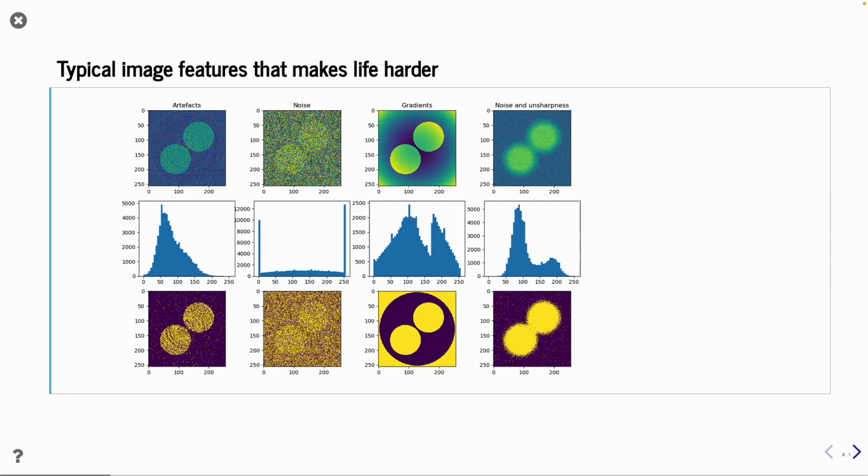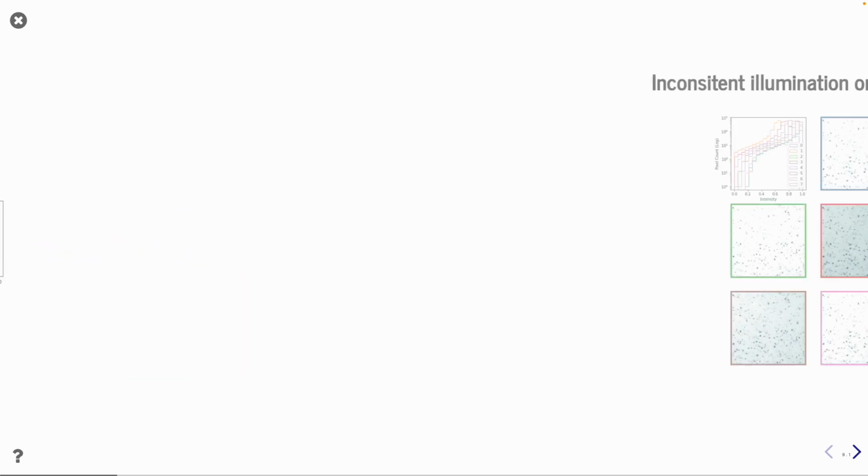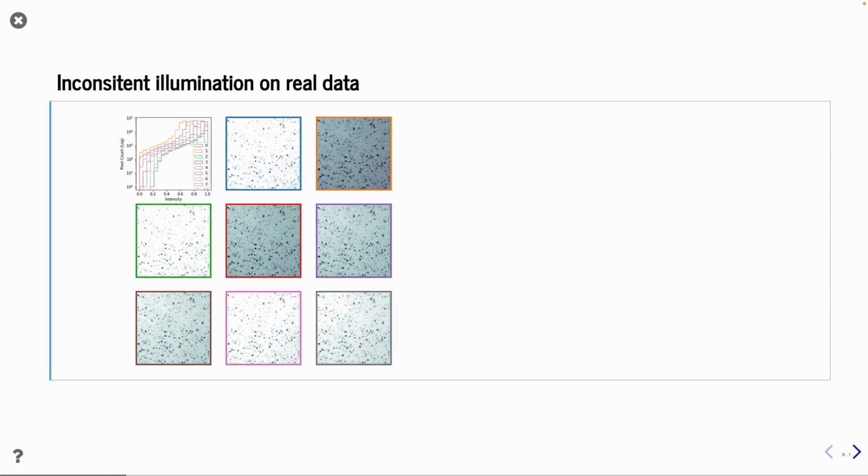But thanks to the unsharpness, blurring along the edges, you have a lot of gray levels which are filling up the gap between. So the more unsharp image you have, the higher the in-between level becomes. And when you try to segment this, of course, you have a great uncertainty in this area. You get quite fuzzy edges when you try to segment it. This is an example of what can happen.